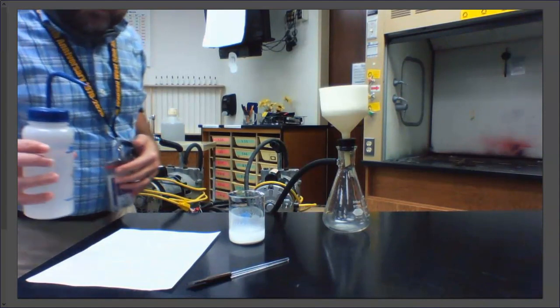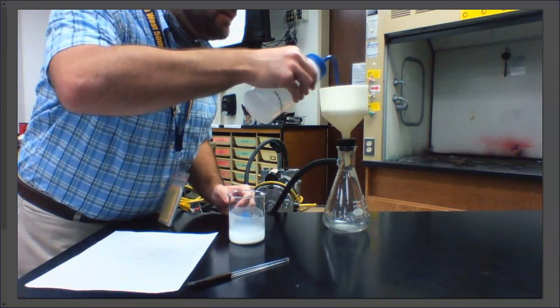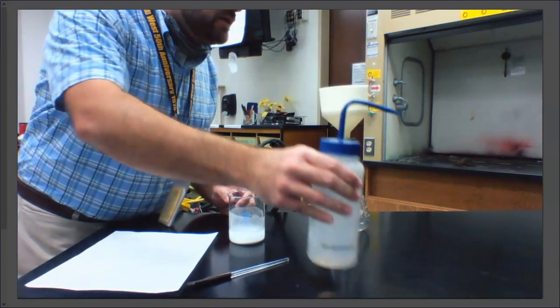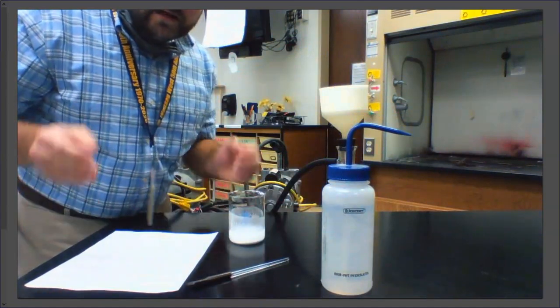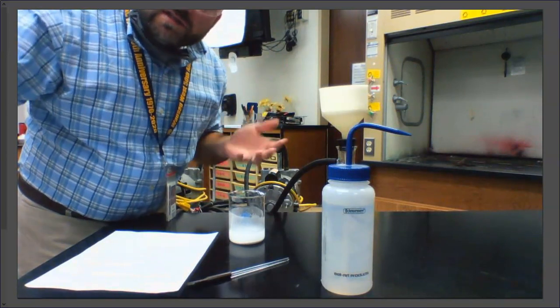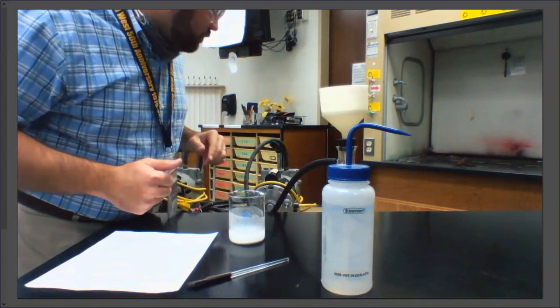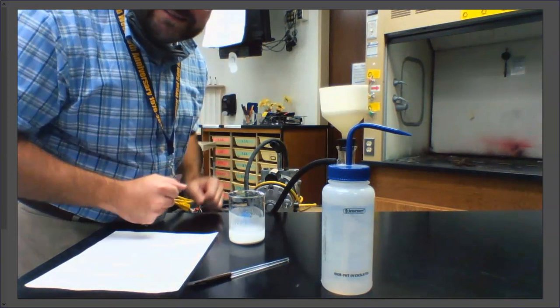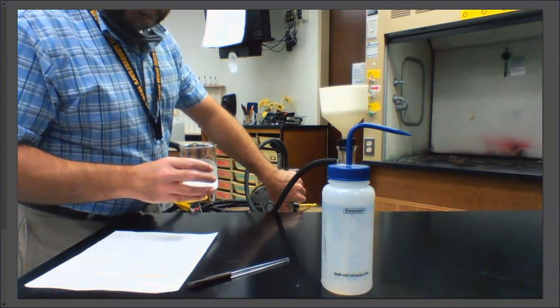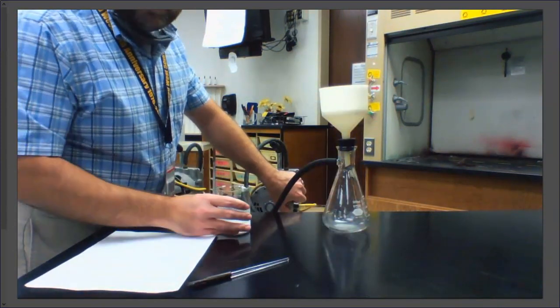when you do this type of filtration, you do want to wet down the filter paper beforehand. The idea behind that is that now it's got a tight seal around the edges, so that when the water hits, it doesn't immediately run off to the side and I lose some of my precipitate in the process. If you wet it down like I've just done and you turn the vacuum pump on, it'll create a nice seal so that we don't lose any of our sample. So I'm going to turn this on. I'll show you just a little bit of how this is going to work, and then I'll pause it and finish it up without you guys watching me.